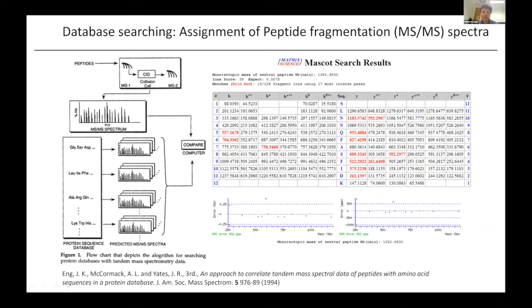And that is shown over here. This particular match between this sequence and the experimental spectrum is highlighted by the red numbers. Each of the red numbers in this table is a fragment ion that was actually experimentally observed in the spectrum. And what it shows is that we've seen a lot more Y ions than B ions. And that's actually quite a typical situation for tryptic peptides.